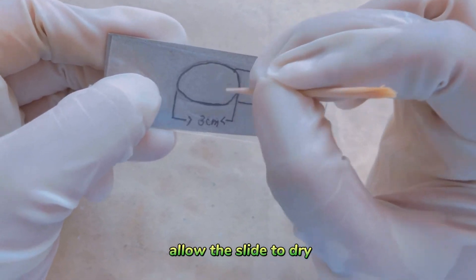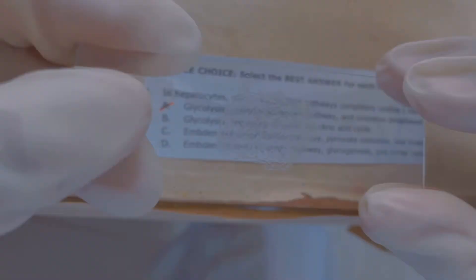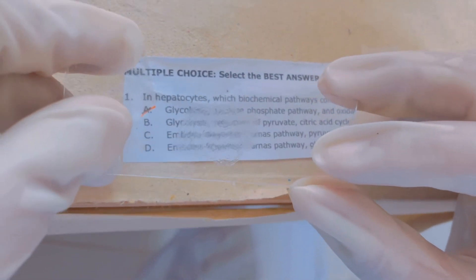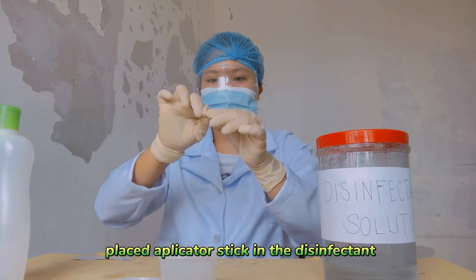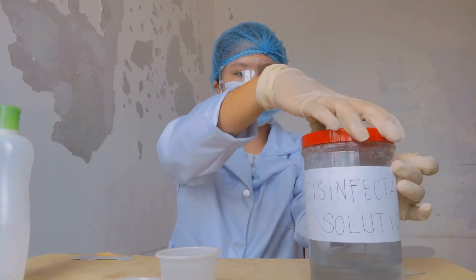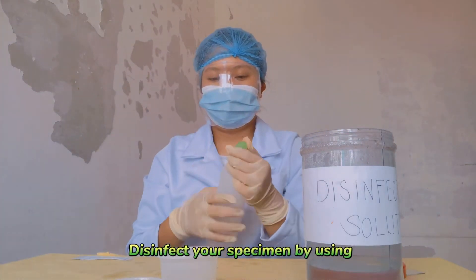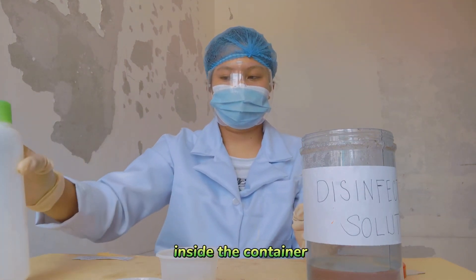Allow the slide to dry. After a few seconds, check the thickness of the smear 4 to 5 cm above the newsprint. Place the applicator stick in the disinfectant. Disinfect your specimen by using a disinfectant inside the container.